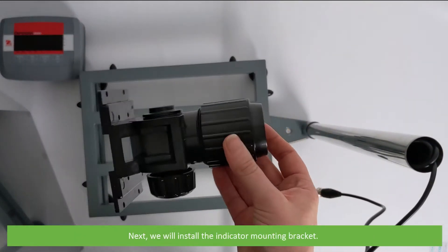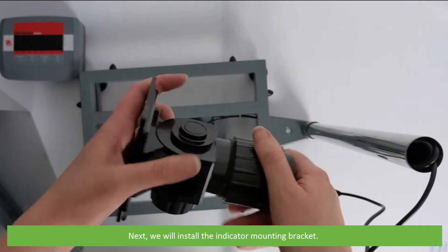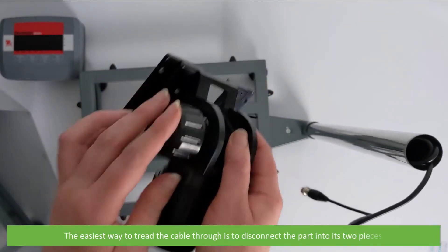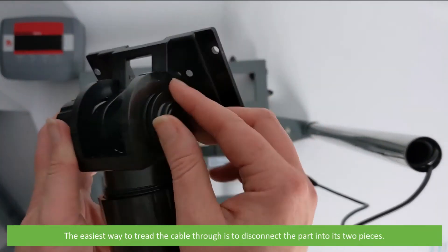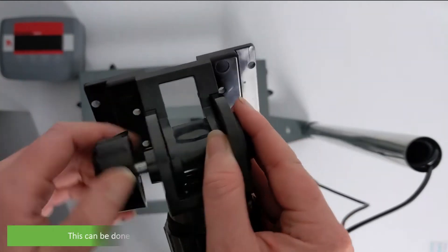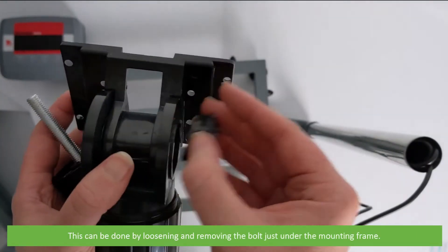Next, we'll install the indicator mounting bracket. The easiest way to thread the cable through is to disconnect this part into its two pieces. This can be done by loosening and removing the bolt just under the mounting frame.